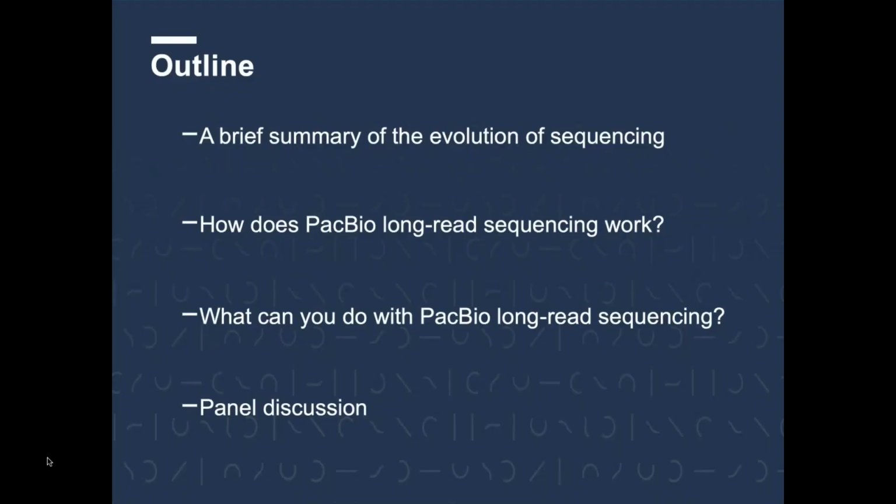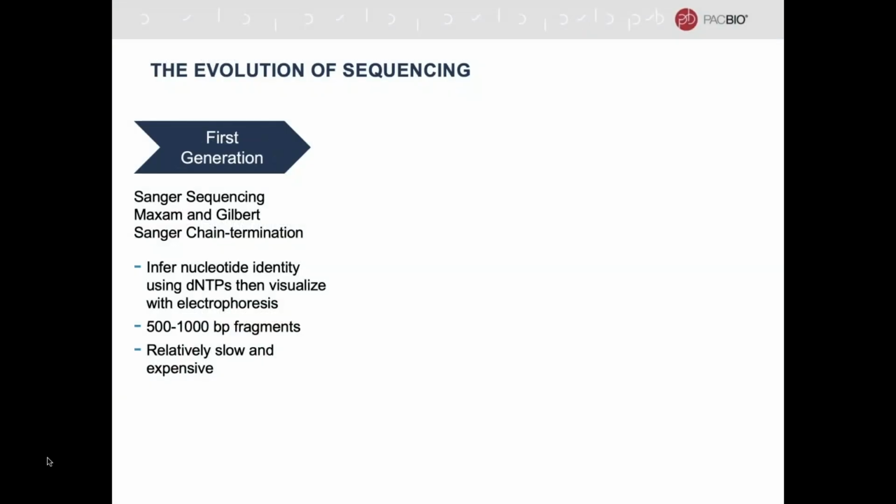So in this presentation, I'm going to give you a brief summary of the evolution of sequencing. We'll discuss how PacBio long-read sequencing works, and then we'll go into more detail about what you can actually do with PacBio long-read sequencing. And then at the end, we will have a panel discussion with our experts.